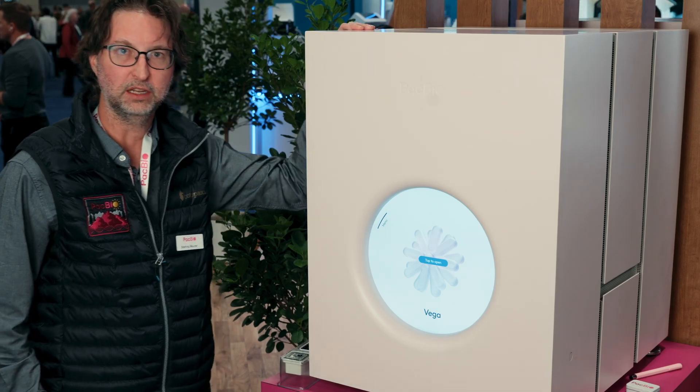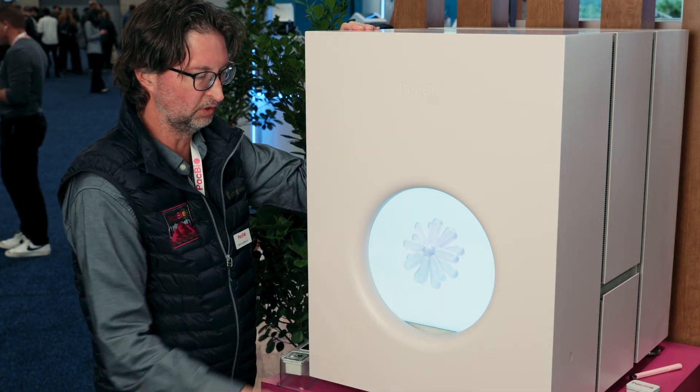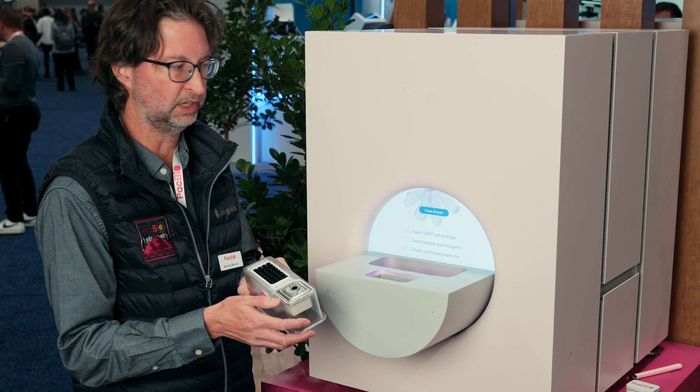Here we are at ASHG to introduce Vega, our new long-read benchtop HiFi sequencer. It's incredibly easy to use. All you do is open the drawer. We have two sets of consumables — it's basically a three-step process to load the instrument.